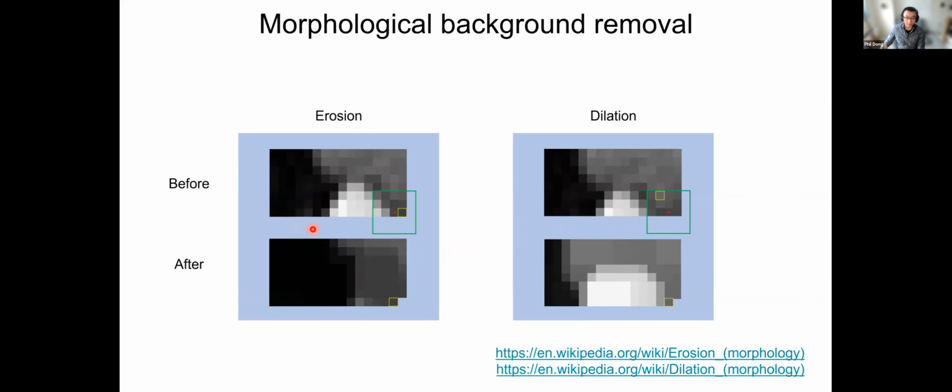We're really ready to extract cells from this movie. So basically the bottom row here in the pipeline is all about extracting cells with the CNMF algorithm. And here is a quick refresher for the formulation of CNMF. Again, you have heard of this in the morning already. I'll try to be quick.